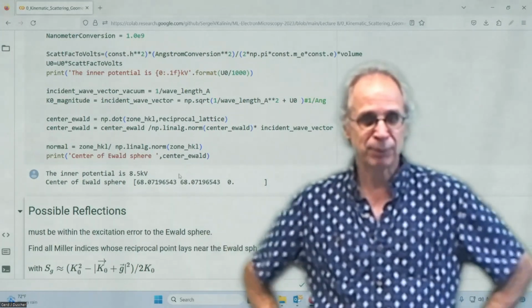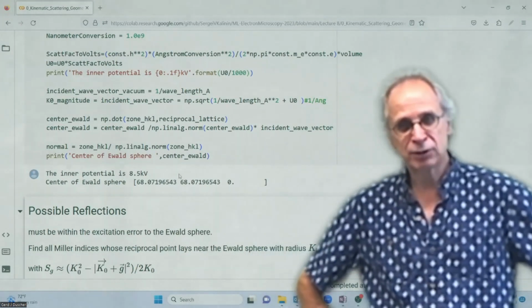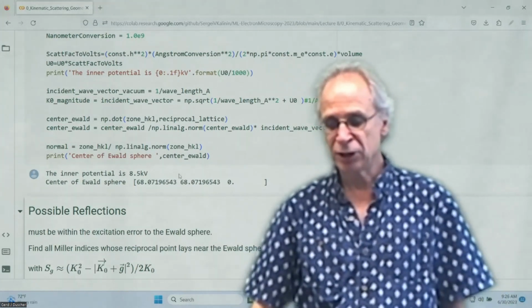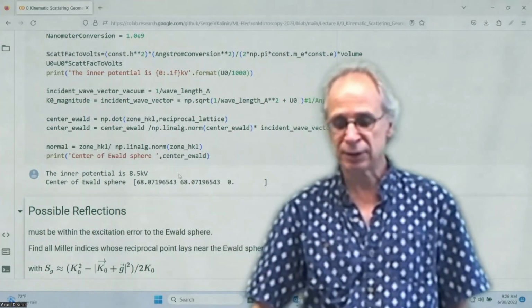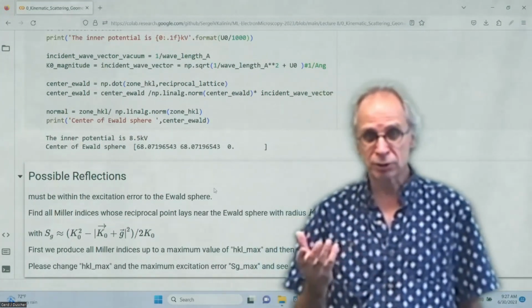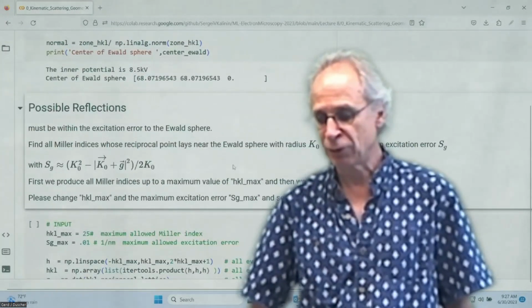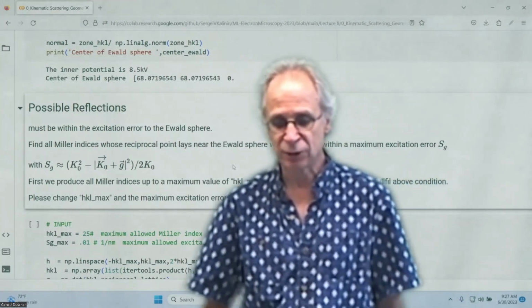The speed of light might be smaller in the crystal. That leads to Cherenkov radiation, so retardation effects. We haven't talked about that in low-loss EELS, but that is one of the things that are usually considered a nuisance. But if you go back to the physics of it, you can actually use it for your analysis. So again, a different effect. And at the time, I didn't use it.